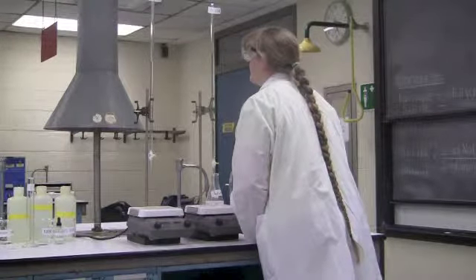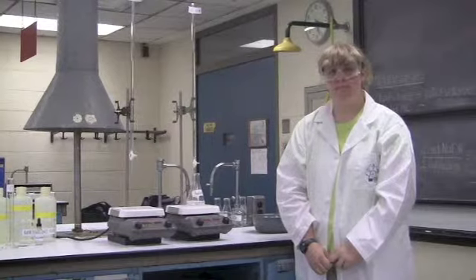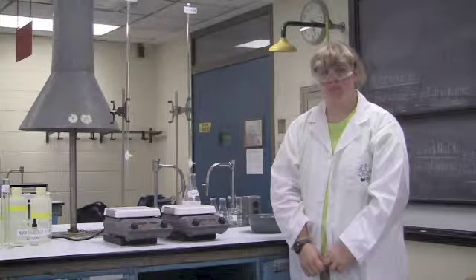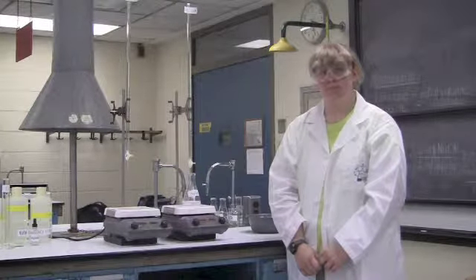The final volume reading is 13.07. A total volume of HCl added was 13.07 mLs. Now we are going to show through the calculations how this makes sense.